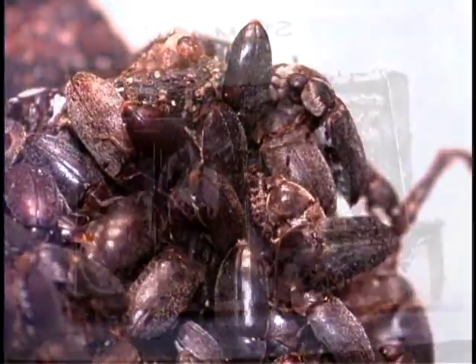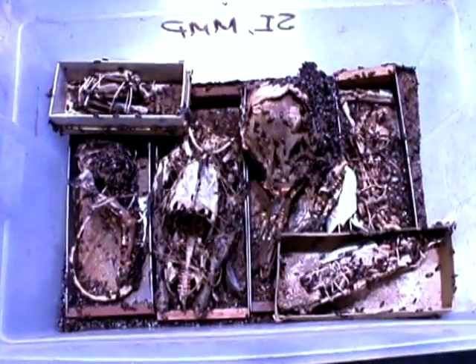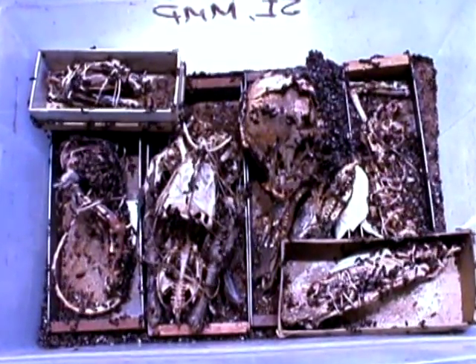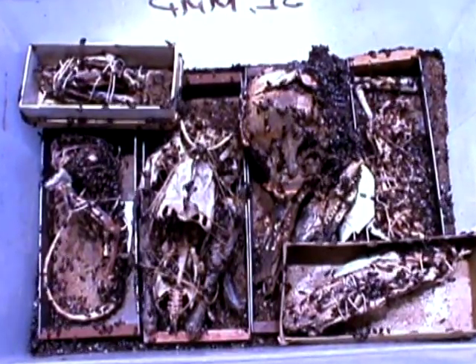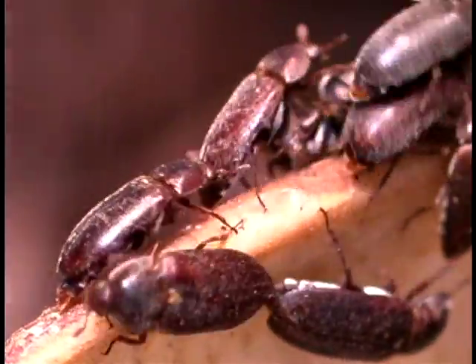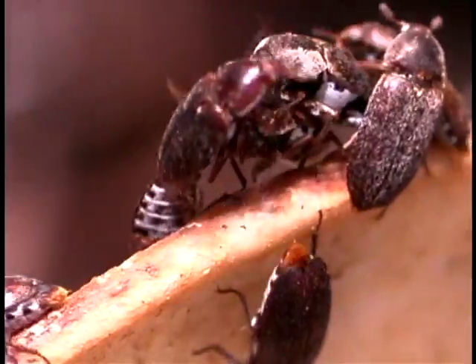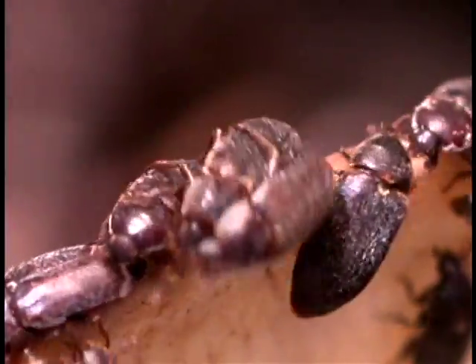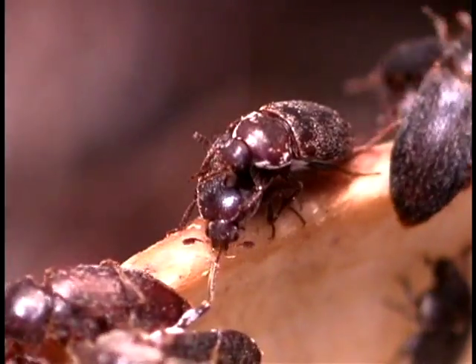In the osteology lab, I have close to a million beetles voraciously cleaning away muscle and connective tissue from any specimens I give them. Female dermestids lay eggs on the soft tissue of a dead animal. Larvae hatch from the eggs in about three days and become adults about 30 days after that. Adults live about three months.